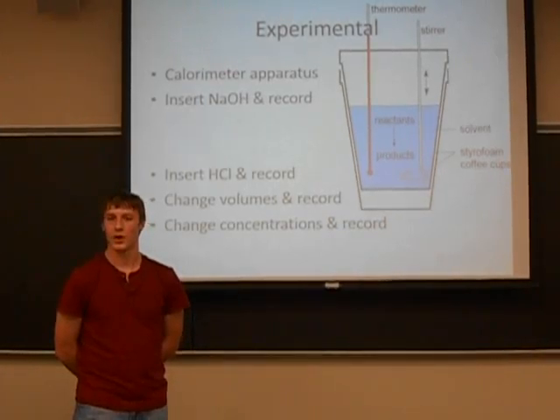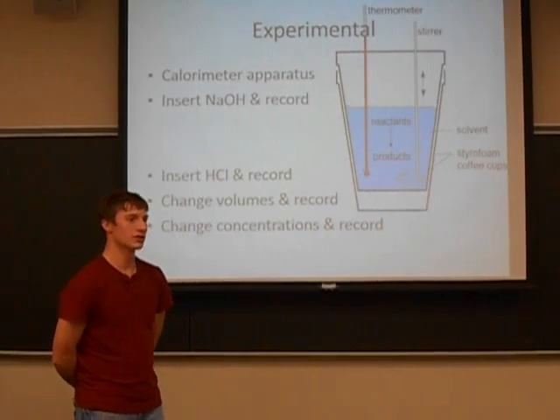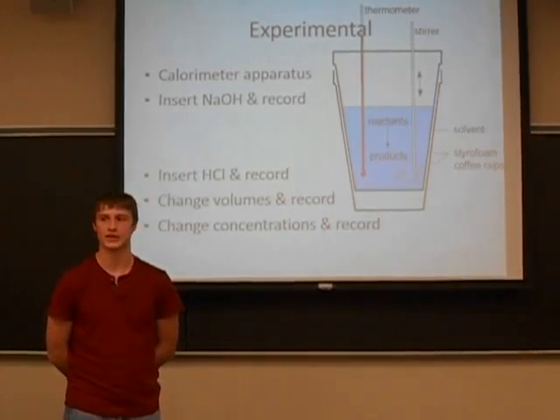Then what we did was scratch the experiment and create a new one using 40 milliliters of 1 molarity NaOH and HCl.